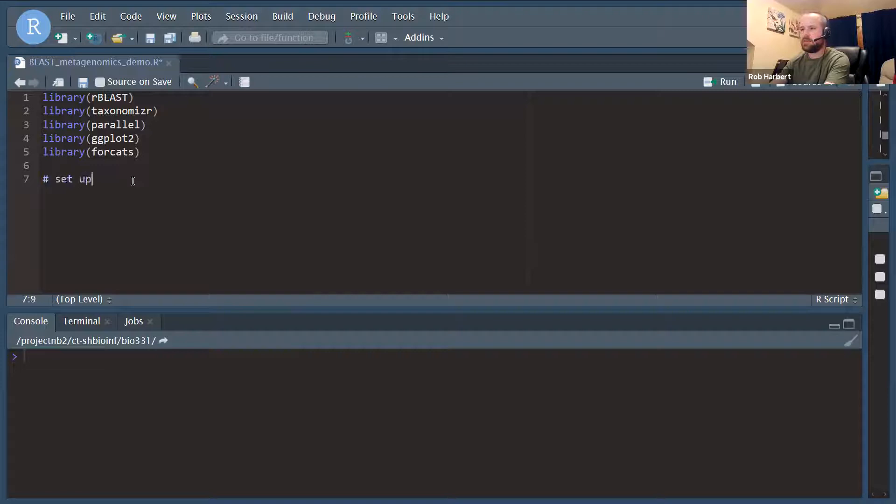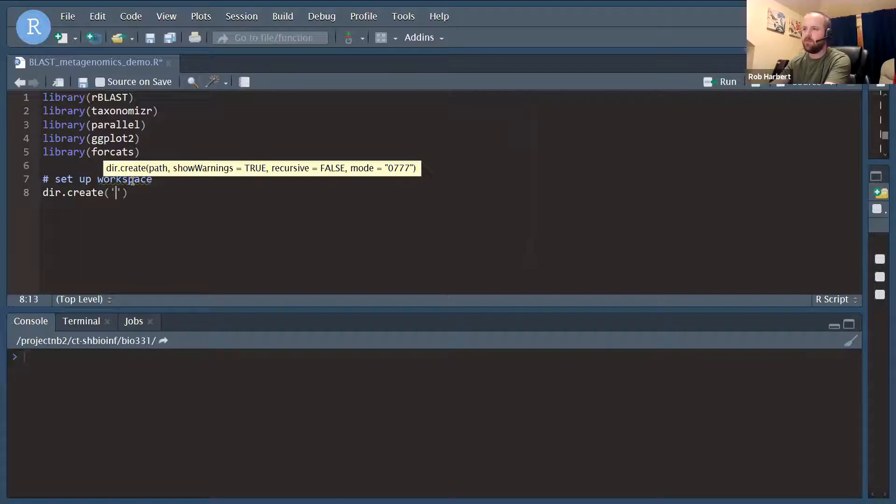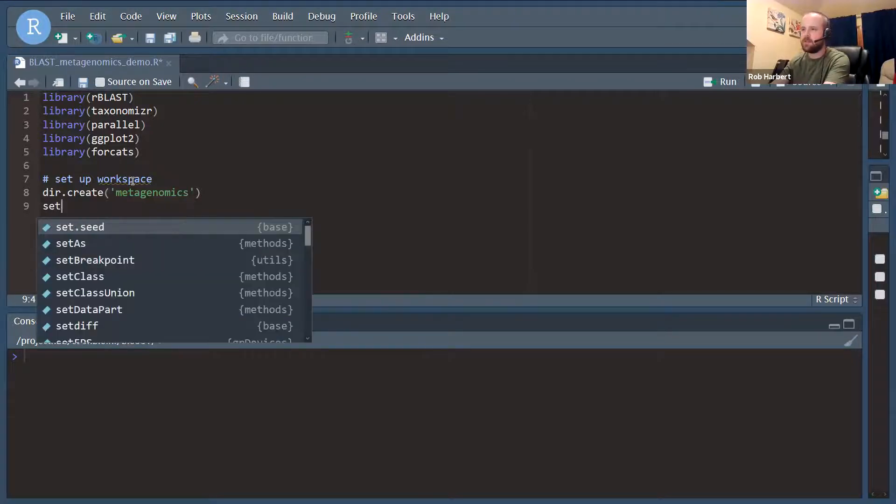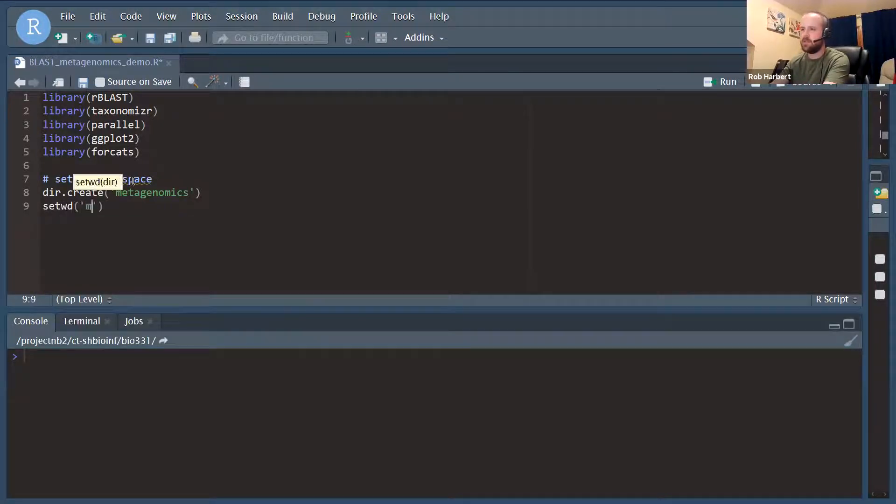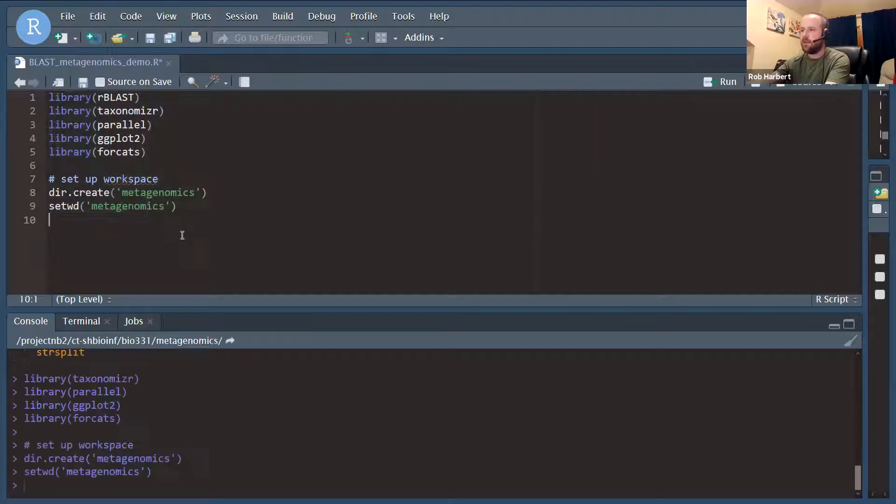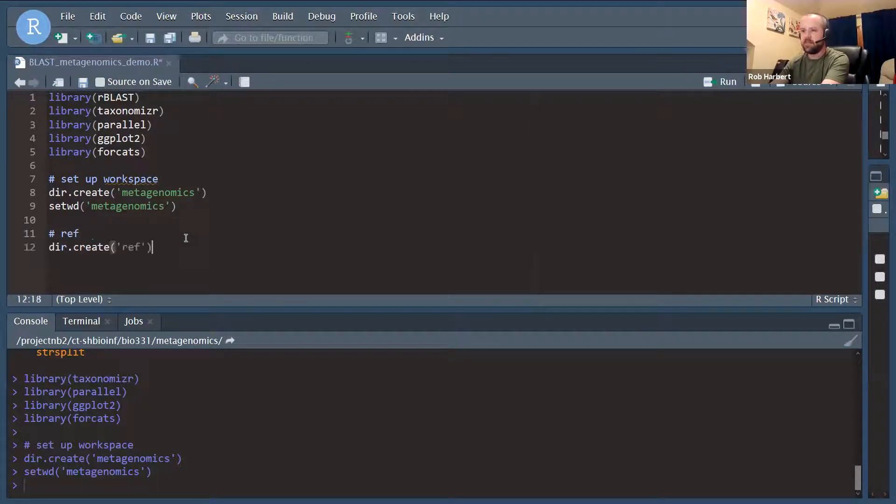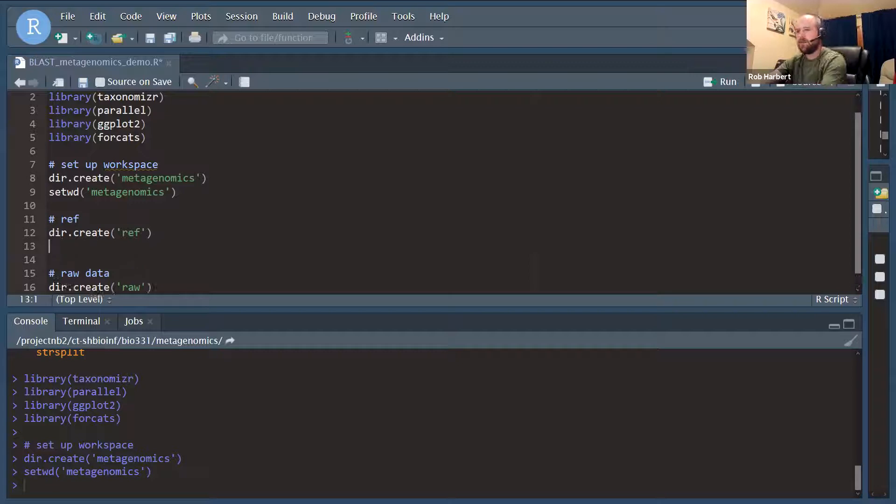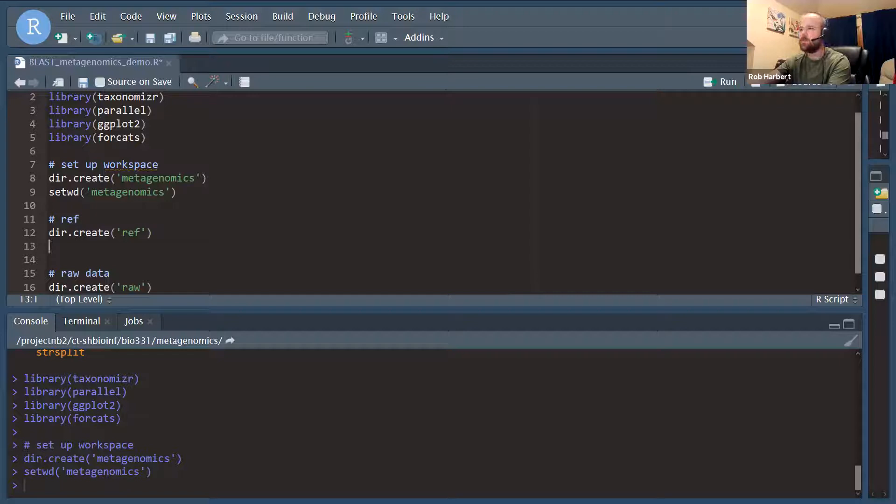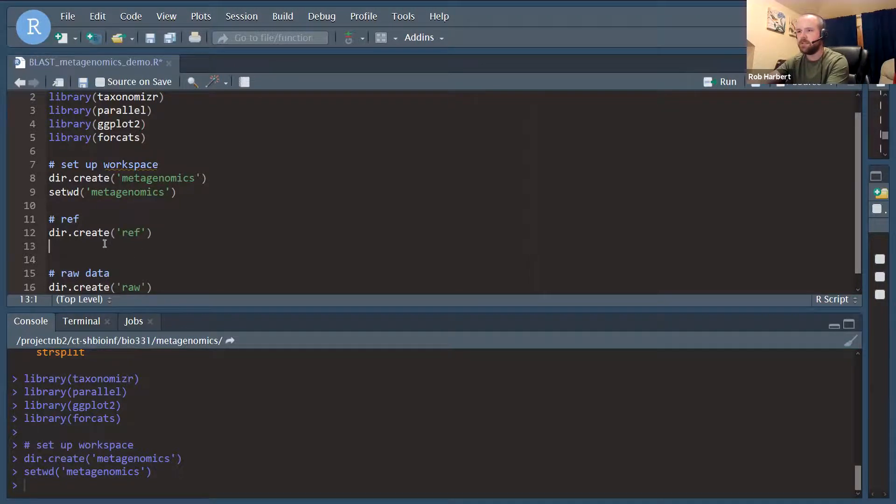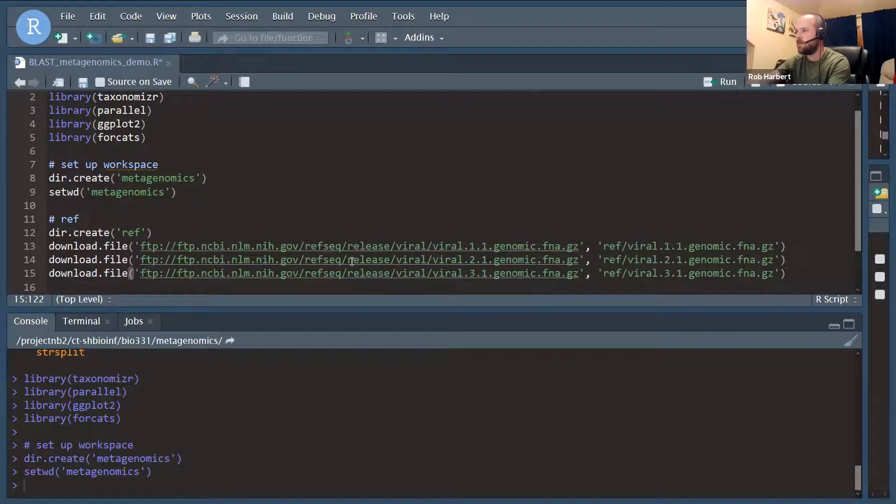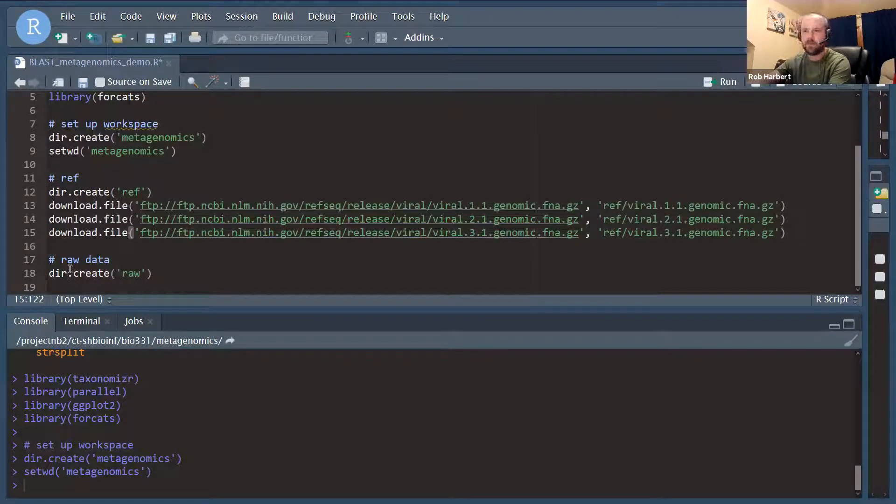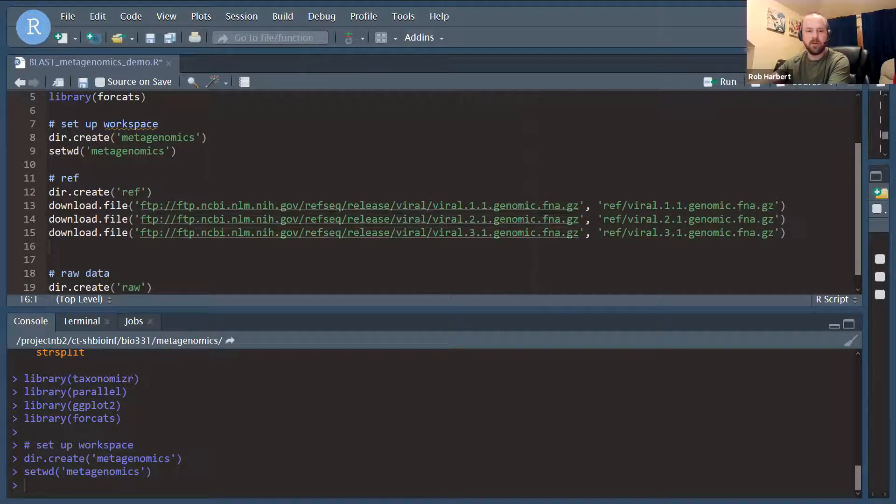Next up, we're going to have to set up our workspace. To do this, I'm going to create a new folder that I'm going to call metagenomics, and I'm going to set WD to move into that metagenomics folder. Inside of our metagenomics folder, I'm going to create two subdirectories: one for reference data and one for the raw data. Inside of our reference data, we're going to need to run some code to download the viral genomic sequence data from the RefSeq NCBI database. I'm going to do that directly from the FTP server. There are three files we're going to get here, and we will unzip those and concatenate them into one file for our BLAST database.